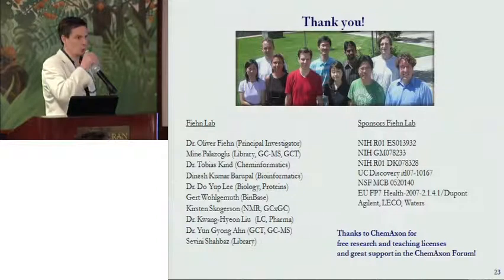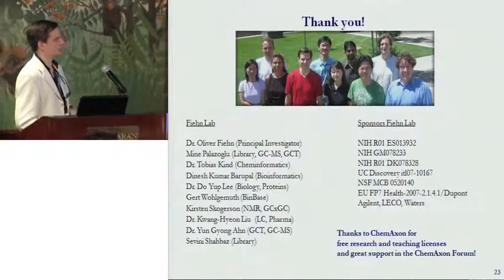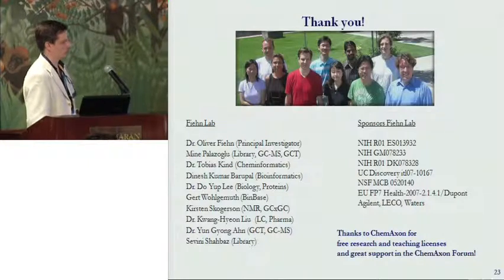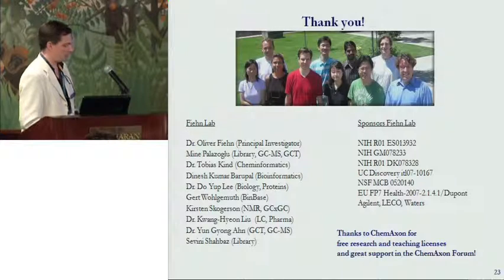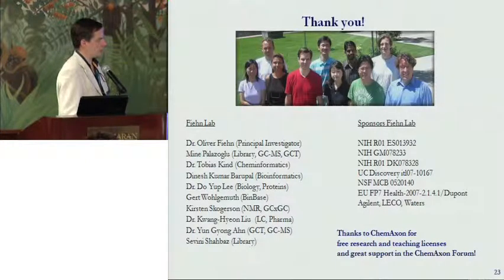Any other questions? I just have a quick question, especially regarding spectral data. It's kind of been a hodgepodge of different file formats. I'm wondering how you manage that. Is there any consensus toward a standard for spectral data that you can use? So for the NMR society, it's pretty clear it's JCAMP, compressed JCAMP. And for mass spectrometry, for multidimensional data, the proteomics society is leading the way, or multiple proteomics groups, and they have mzData and mzXML as their formats, but they're still fighting. And for mass spectrometry, they are pretty lazy. In this case, it's NetCDF, as somebody already mentioned, as a format for one-dimensional data, but it cannot handle multi-dimensional data very easily. But nobody wrote tools for it, and also JCAMP. But it's a big problem.